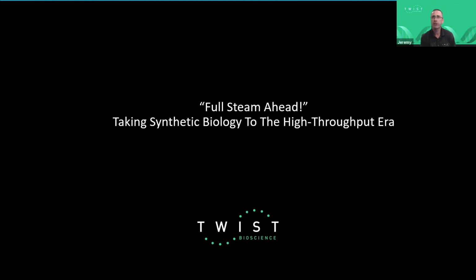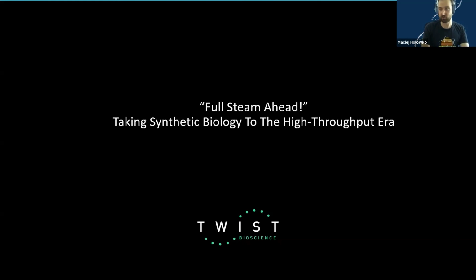Okay. Joanne's got another question. Hi there, the BioFoundry sounds great. Some questions. What organisms can we use? Bacteria, yeast, tissue culture, i.e. plants or animal cells? Currently we work only with bacteria and yeast and diatoms. So those are the three classes. We cannot process mammalian cells or any other higher organisms yet, maybe in the future. So those are our limitations. Currently it's mostly for microorganisms.